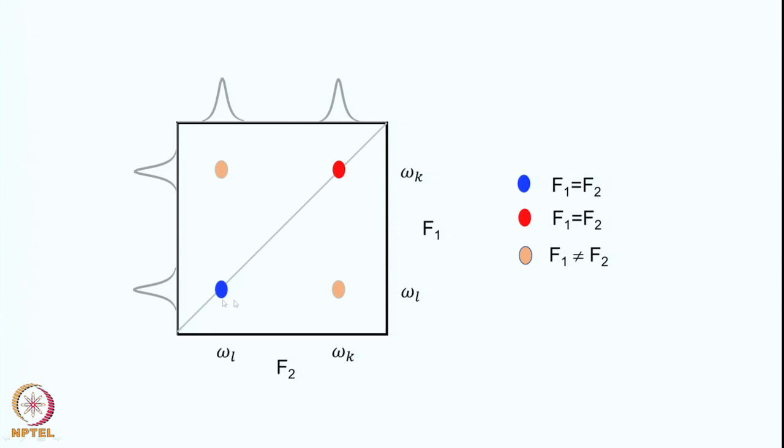But there is no stopping. If you are exciting both the spins at the same time, then the same thing can happen for the spin l as well. So, if you started with the spin l, then during the T1 period it will evolve with the frequency omega l, and during the mixing some of it will get transferred to omega k. Therefore, this will produce a cross peak here and a diagonal peak here. So, therefore, each one of these will produce a diagonal peak and a cross peak. This will depend upon the interactions between these two spins, whatever the interactions are, and that will be reflected in the 2-dimensional plane. And this was a phenomenal effect, because where there are lots of signals present underneath at one particular place, you could filter out those signals which are interacting. Okay. So, you can figure out from the cross peaks which spins in this spectrum are interacting.